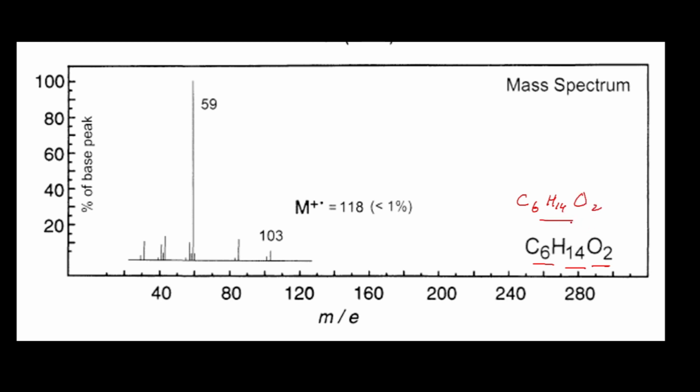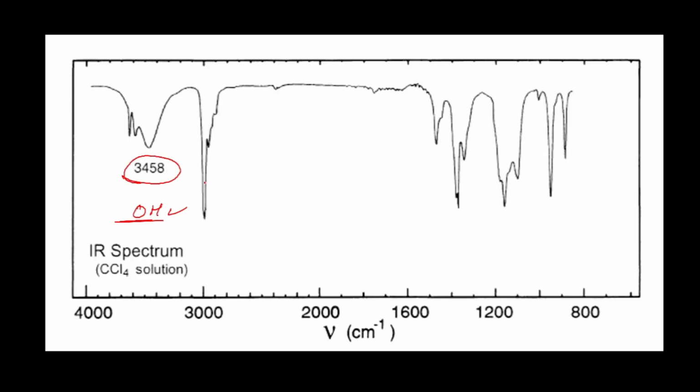This is very important because you can easily elucidate the structure from this molecular formula if you know the specific functional groups as well as the specific kinds of carbons and hydrogens. So one kind of hydrogen that you have already known is the hydrogen in the OH group.